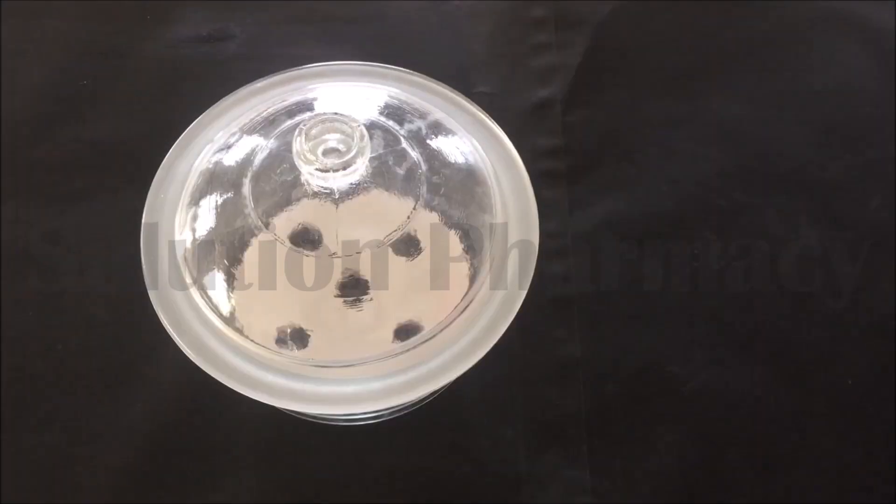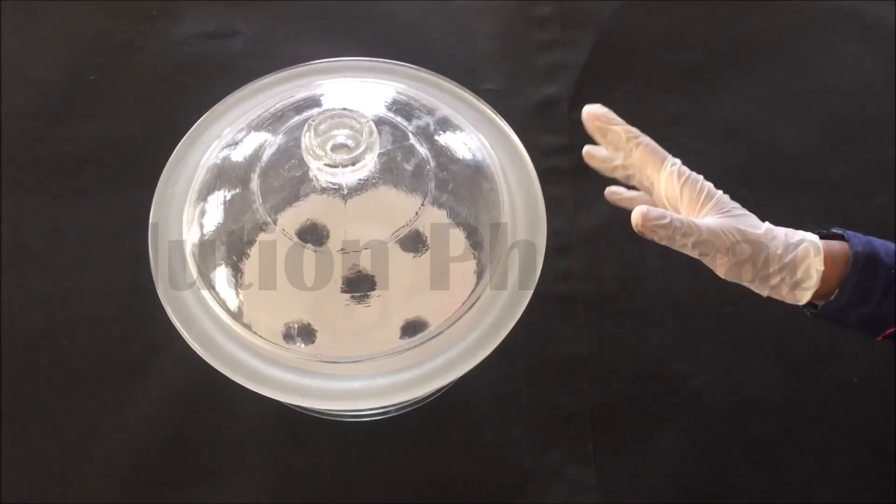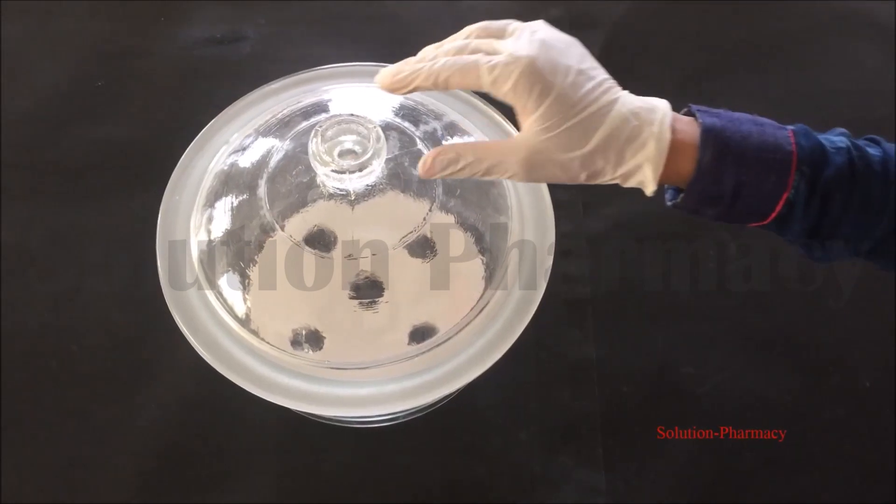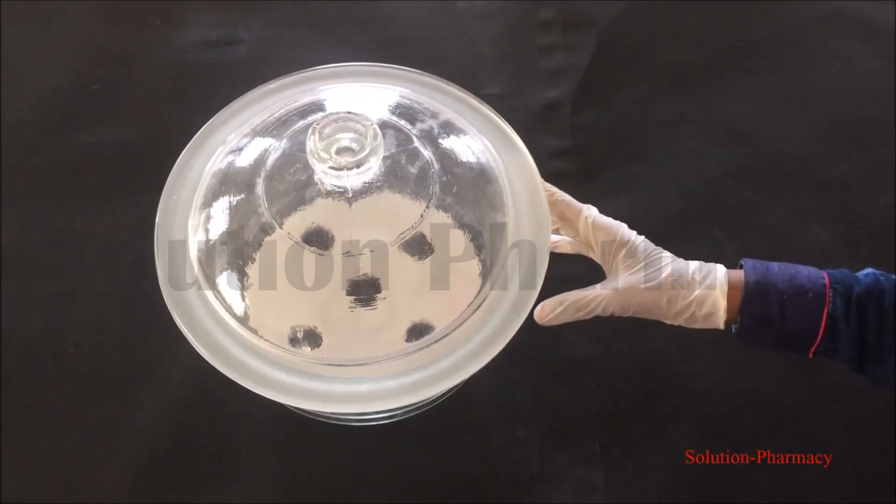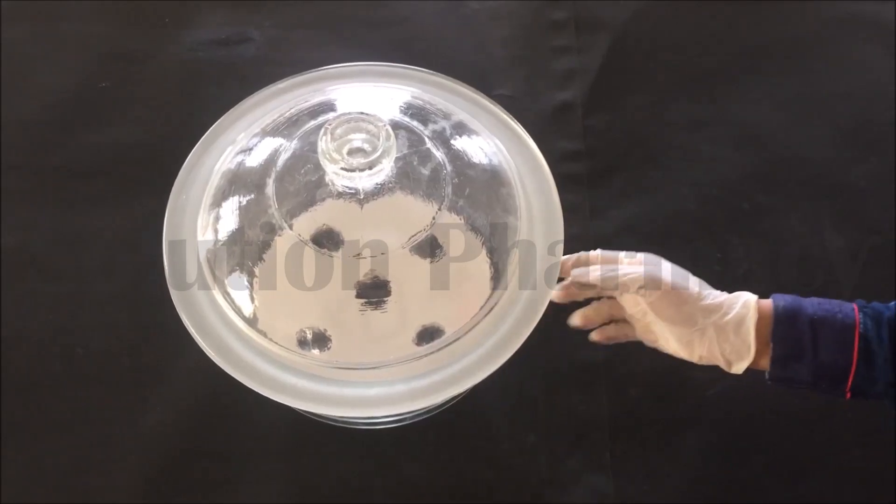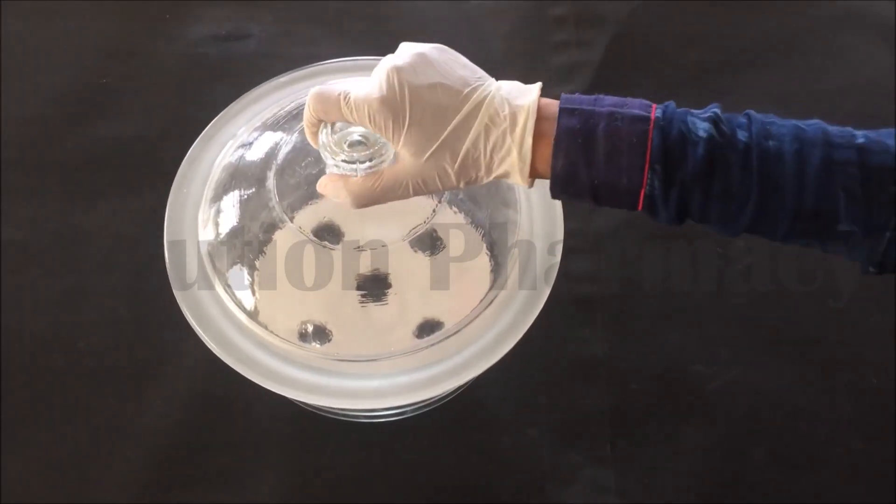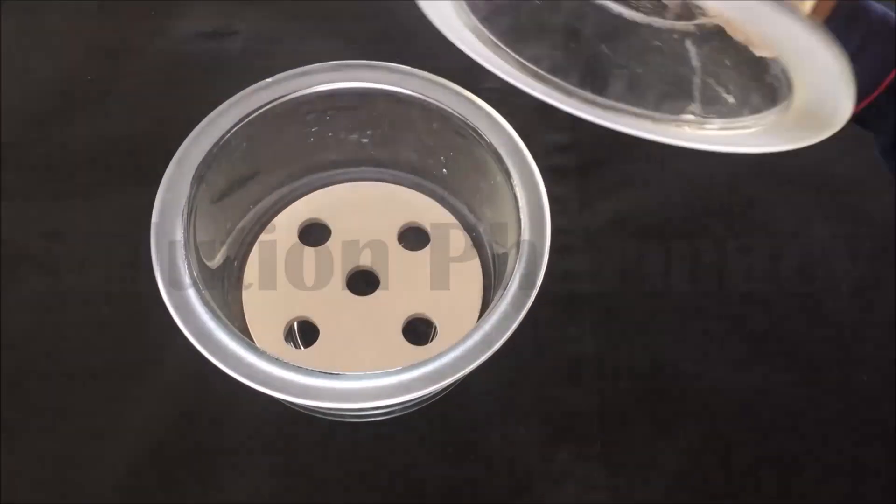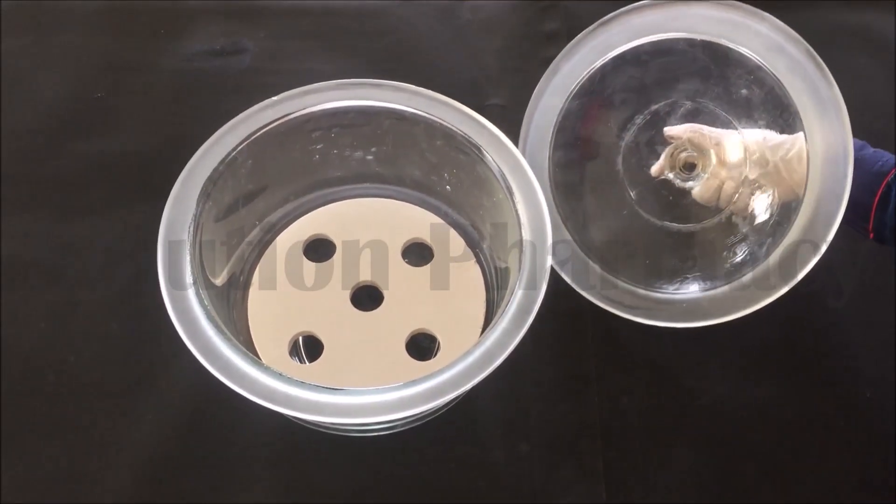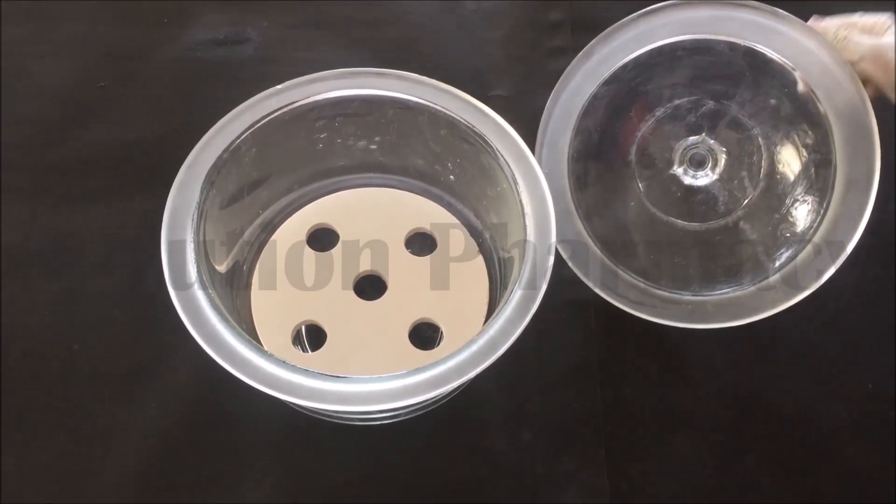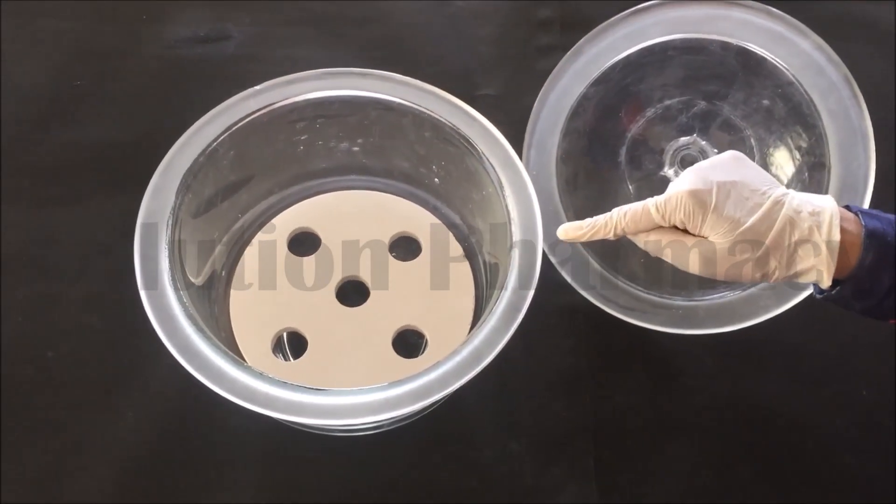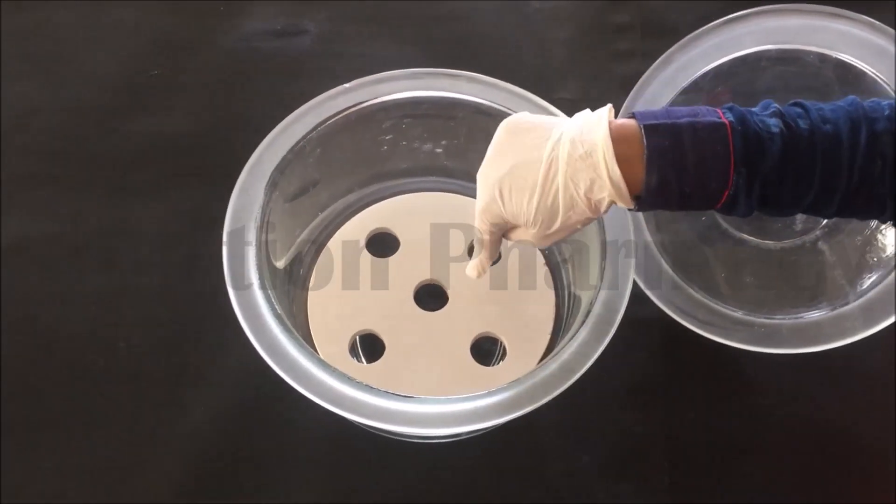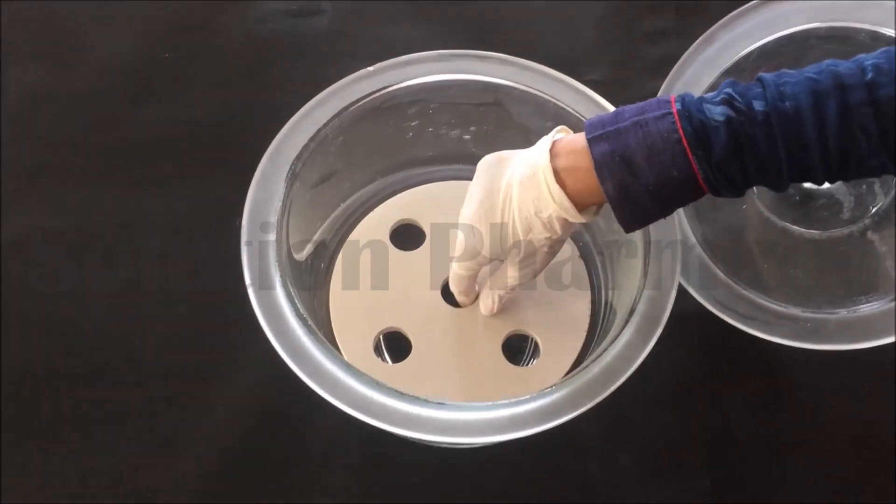Now let's know the parts of desiccator. This is a desiccator which is an airtight vessel and this desiccator is made up of glass. At the top of desiccator there is a lid. Remove the lid and keep it aside. This is the edge of lid which is called ground glass rim of the desiccator lid, and we have to do greasing here to make the desiccator airtight.